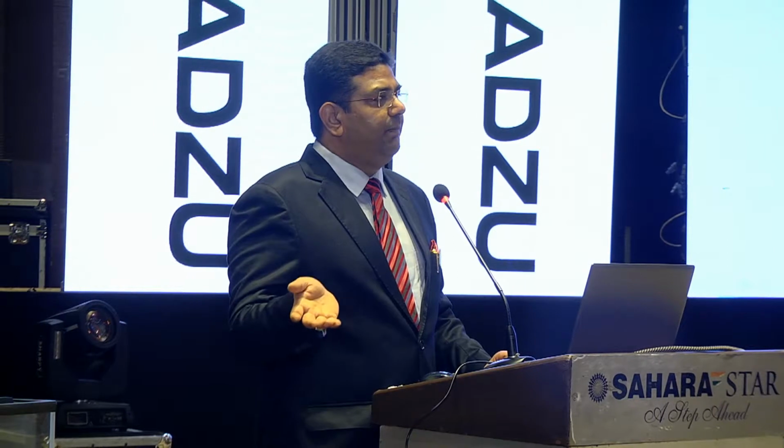It's complicated, it's not that easy to configure the software. Nagesh, Venkat and Satish will help you with the software configuration for that customer. And you have a static printer which can be used by existing customers using any Shimadzu balance who want to have CFR compliance. So a whole new product range is open to every one of you. I wish you all the best and thank you very much once again.